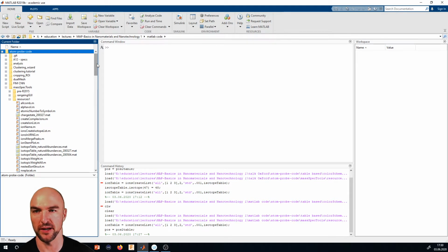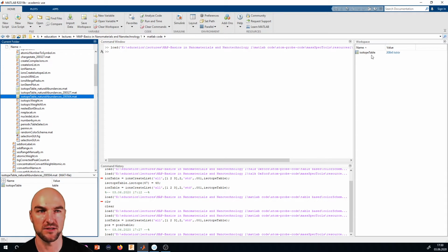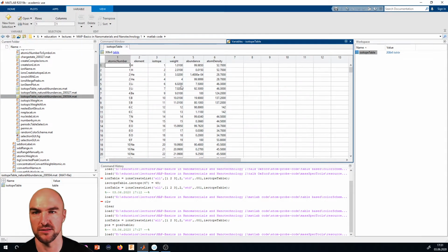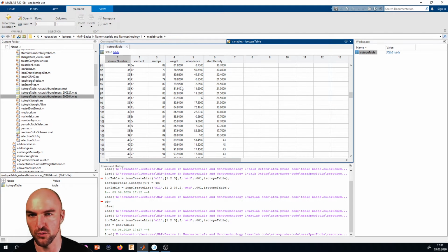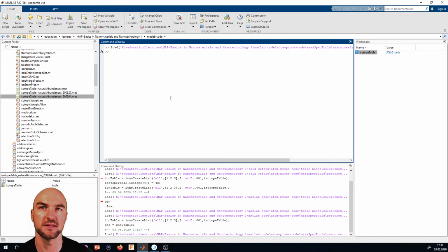So how does the whole thing work? Well, we have some ground truths and we have some data. Let's start with the ground truths. The ground truths, as we call them, are first of all our isotope table. Our isotope table is simply, as it says, the table of isotopes with their abundances. We'll give you one with natural abundances, but you might have reasons to change those if you do isotopic experiments. The simplest isotopic experiment is you have an FEI FIB and you only have one gallium isotope, things like that.